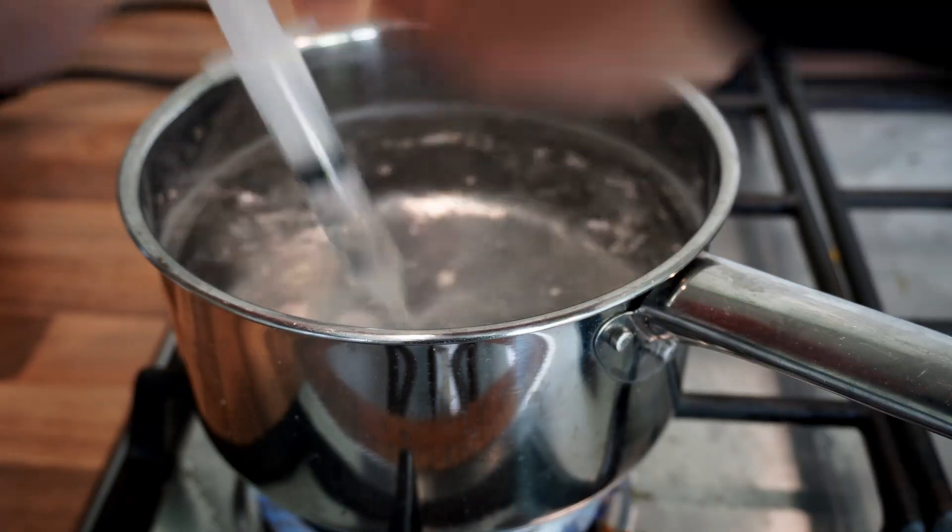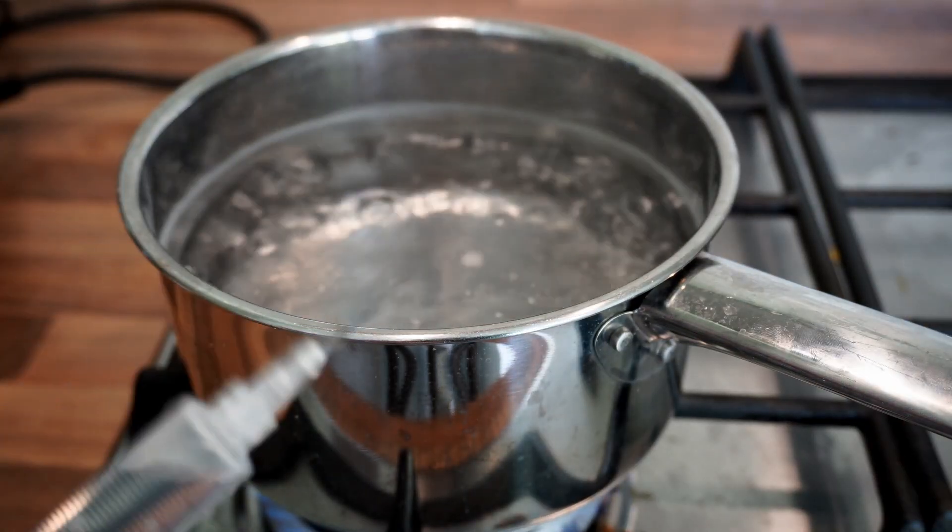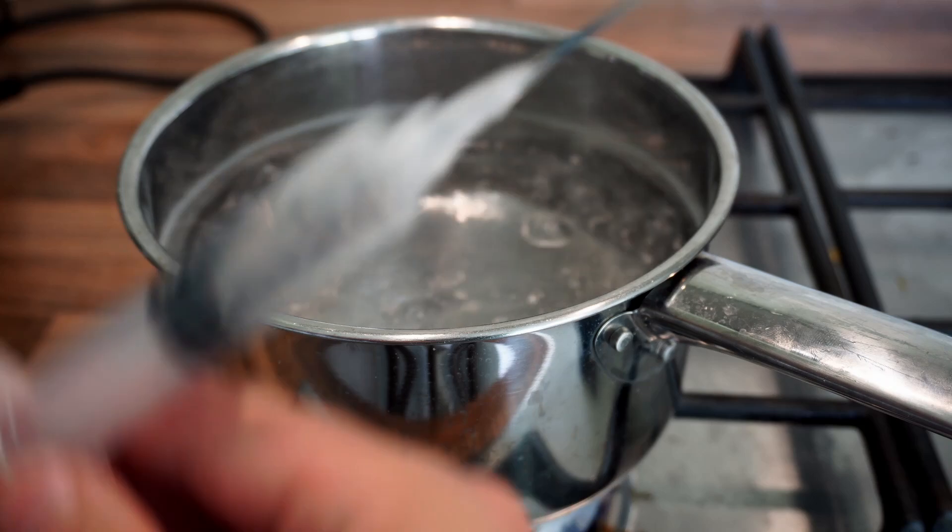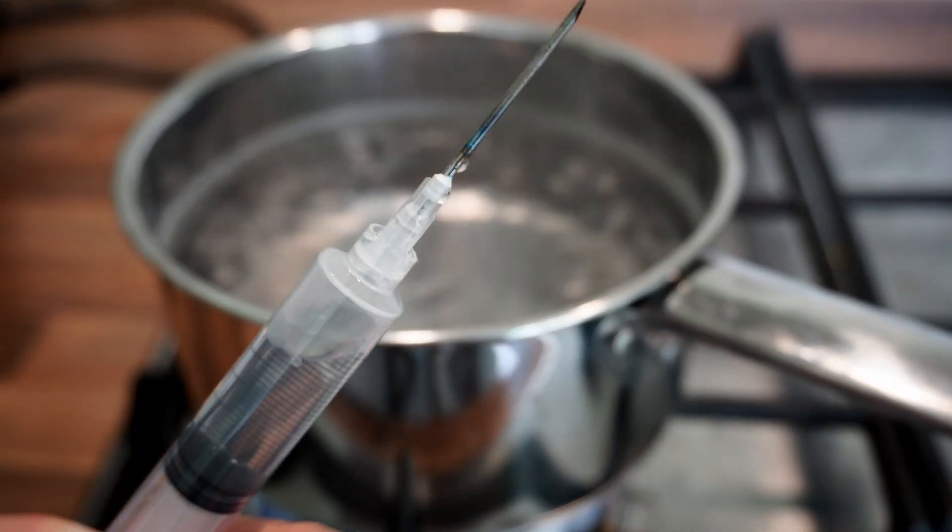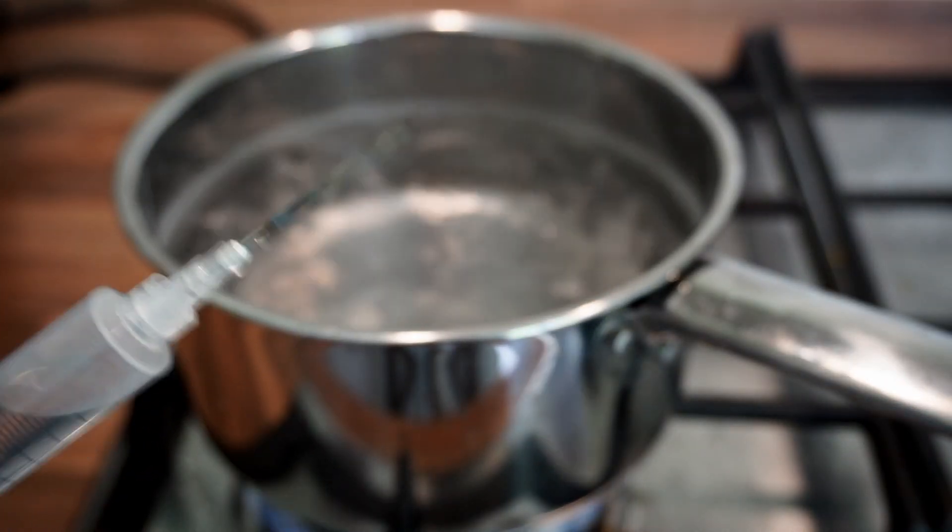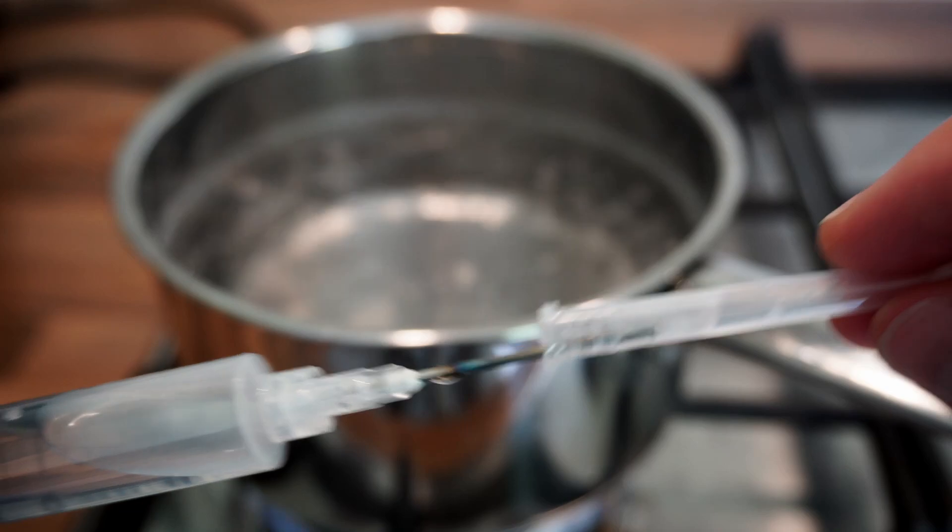Next I'm going to flush the syringe three to four times with the boiling water just to clean out the inside. Draw up a small amount of air and then put the cap back on the syringe.